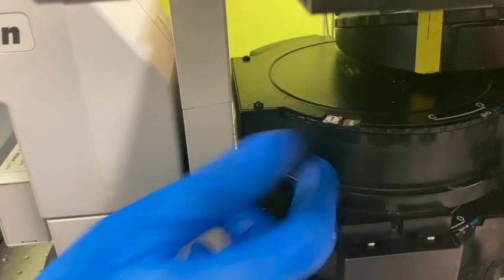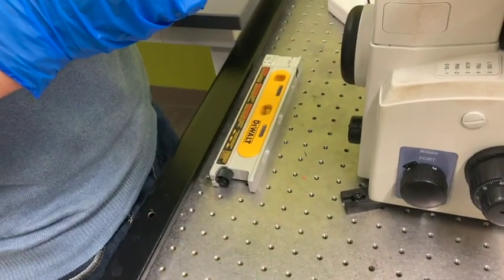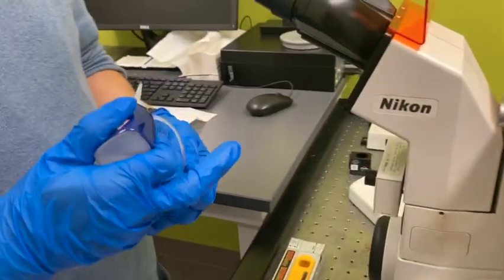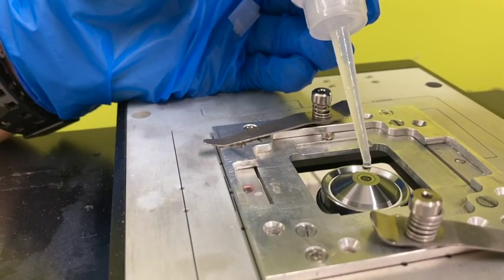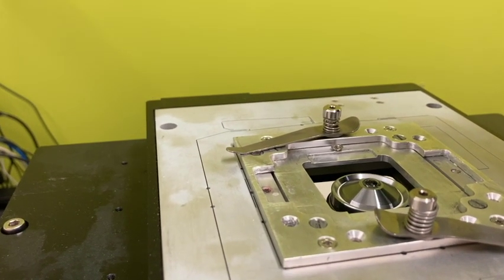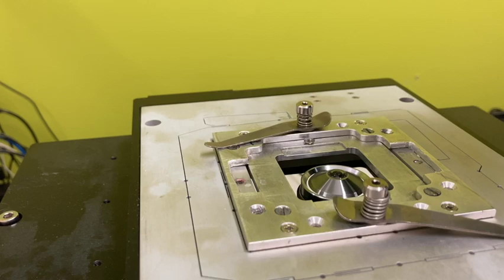And we have one. So let's try to put some microtubule. Maybe you can see it. This is really the very beginning of the movie. The oil amount is kind of arbitrary. You can put one or two drops. The rule of thumb is to have at least a very thick layer between your sample and the objective. I normally do two drops.